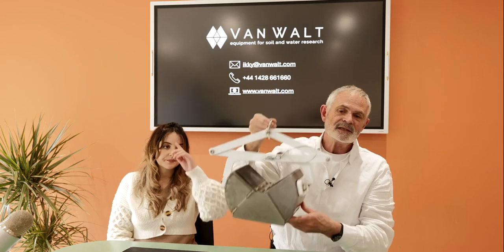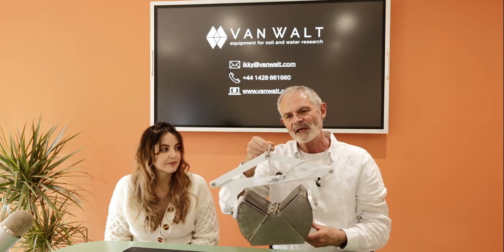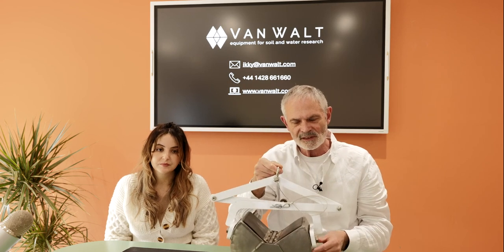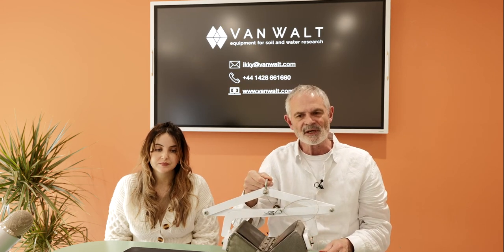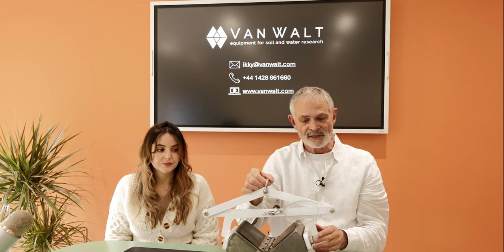And it needs to be heavy, and this is important when you use this device. Make sure that it's heavy enough to do the job that you want to do, because if it's too light when you hit the seabed, it's not heavy enough to penetrate into the soil, and therefore when the jaws close, it's not taking any sample at all. So yes, it has to be a little bit heavy. This particular one is a good mixture of enough weight to do the job. Of course, you only get the surface material.